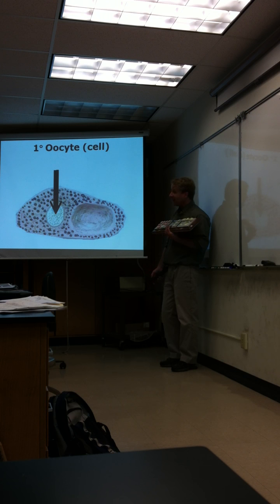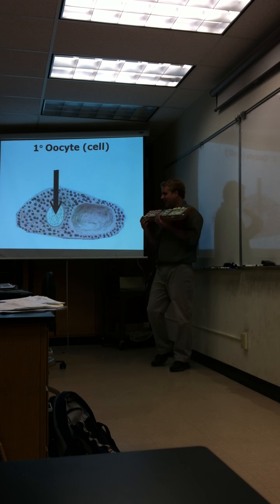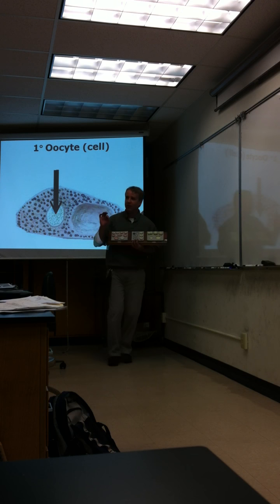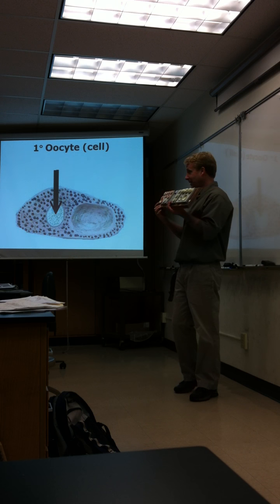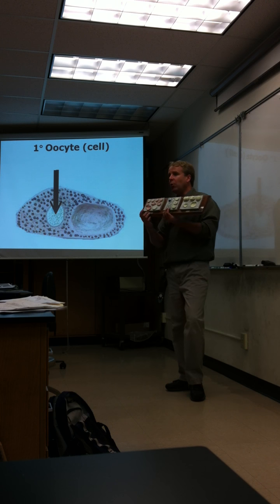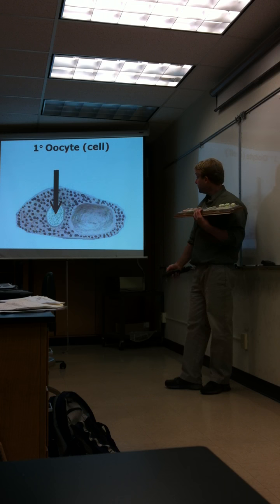So even though this is a secondary follicle, you have to remember that all oocytes are primary oocytes except in the mature. That is probably one of the things most often missed. If you're given a secondary follicle, people like to call the oocyte a secondary oocyte, but it is not until it gets to mature. Everyone okay with that? And remember, in the microscope, we're actually not even going to look at a mature follicle. So you will always say primary oocyte when looking in the microscope.